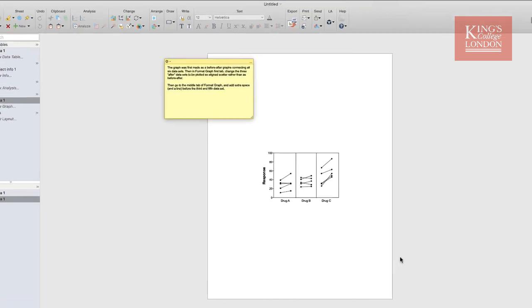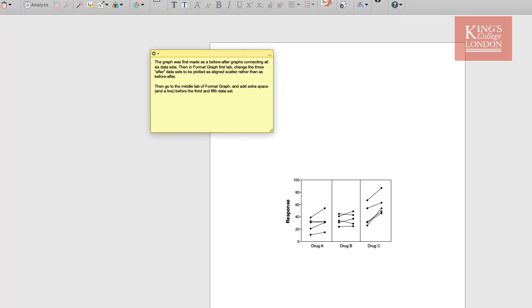In addition, helpful hints will be appearing on the screen such as this yellow box that will tell you how you handle these data sets and how to format the objects within them. So if you're stumped for choice on how to make a new graph, these are often a very quick way of starting.